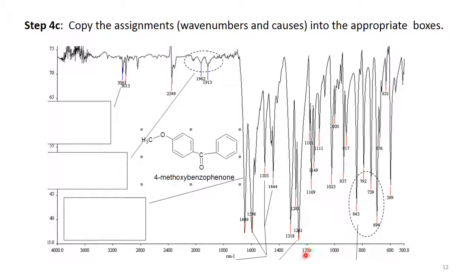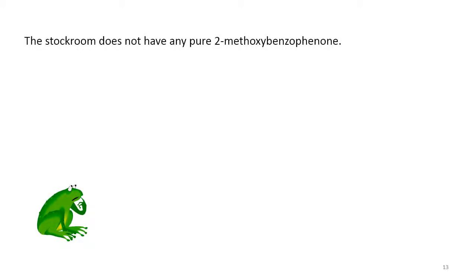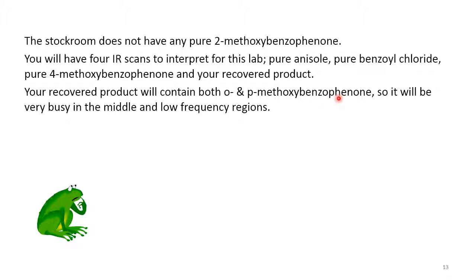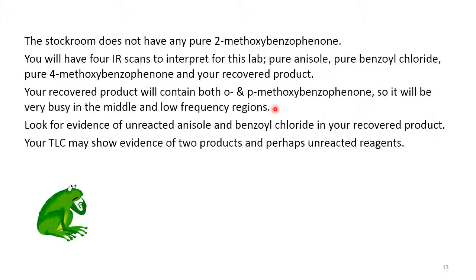Here is the IR scan of 4-methoxybenzophenone, which is para-disubstituted. At 830 wavenumbers is the out-of-plane bend absorption for a para-disubstituted aromatic. At 690 and 770 wavenumbers are the two absorption bands for a monosubstituted aromatic ring. Note that the stockroom does not have pure 2-methoxybenzophenone, so you'll have four IR scans to interpret: pure anisole, pure benzoyl chloride, pure 4-methoxybenzophenone, and your recovered product. Your recovered product should contain both ortho- and para-methoxybenzophenone, so it will be busy in the middle and low-frequency regions. Also look for evidence of unreacted anisole and benzoyl chloride in your recovered product.